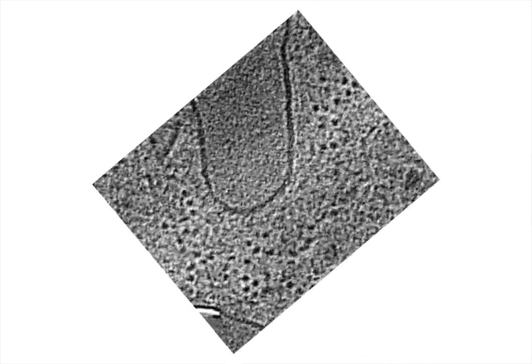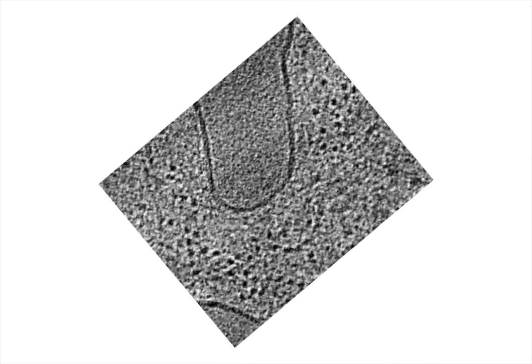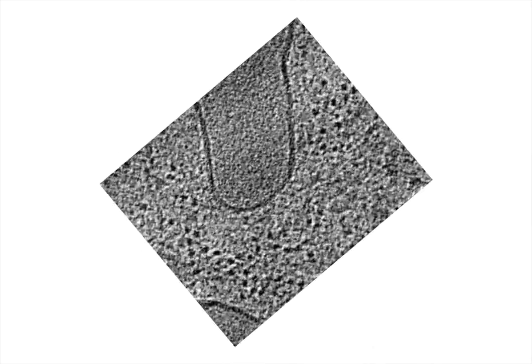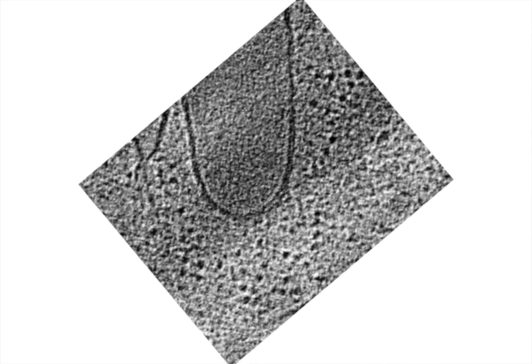Traversing up and down through the Z dimension of the tomogram illustrates that the actin filaments are running perpendicular to the image plane and parallel to the septal membrane.